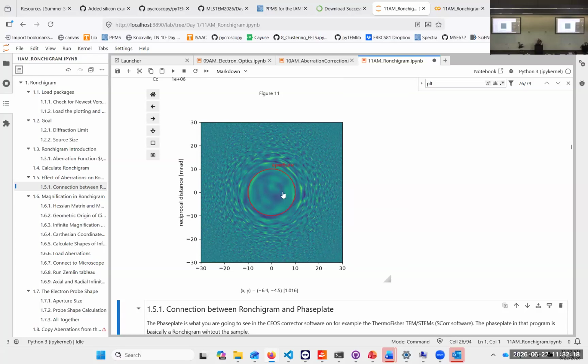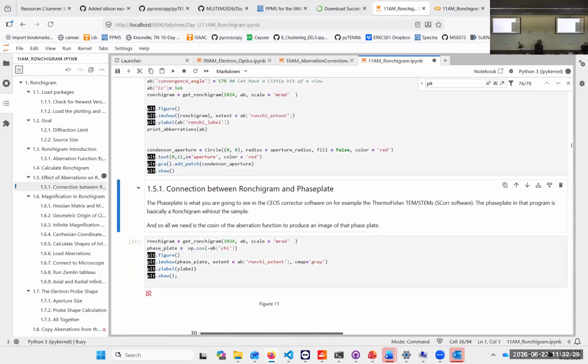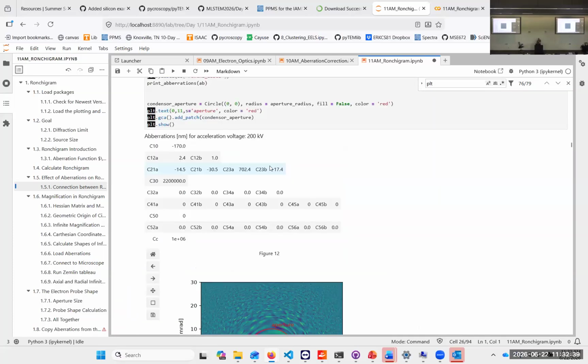You see it's more or less homogeneous in the center. Maybe we go a little bit smaller. Yeah, okay. So you see, we have a little bit too large of an aperture chosen here than we would want. And we have the different parts.